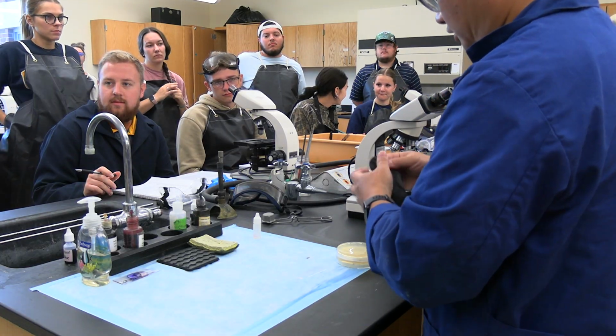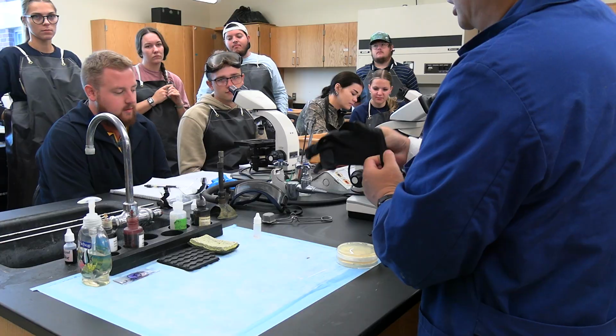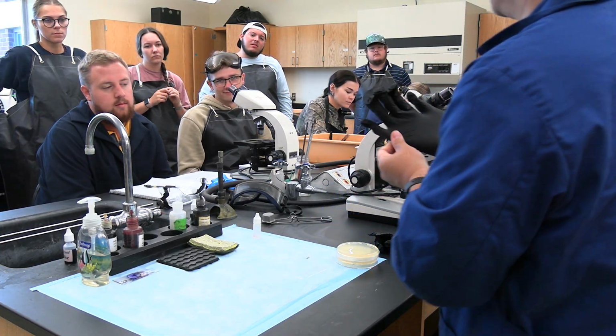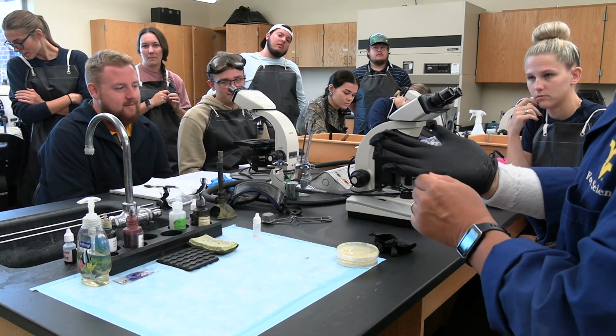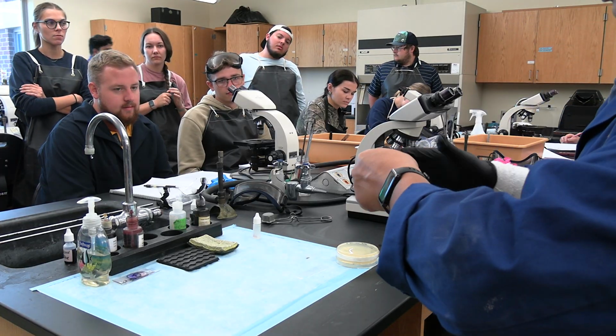So we'll see whether we're going to be successful today. Sometimes the staining needs a little bit of luck. And the microscope needs to be working. That's very important. Otherwise, it's all going to fail at the very beginning. So we'll see how we're going to do it.